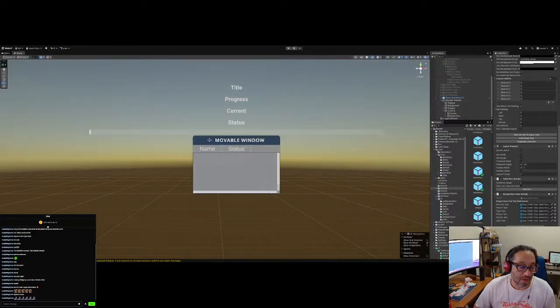So all it is, you're just referencing the text, right? And then when you set the data, you grab the sample, and from the sample you grab the data and change it to whatever format you need. If something's an integer, either cast it or convert it to string, and it'll make it that.